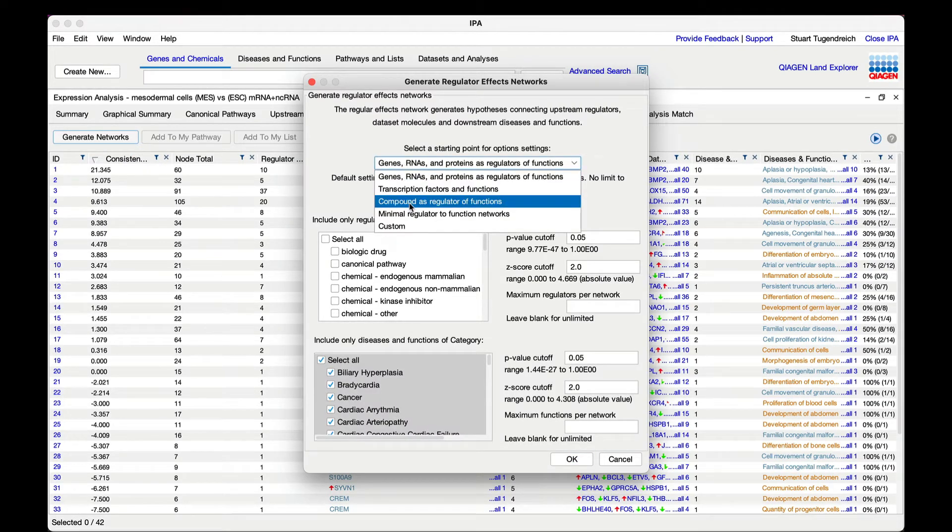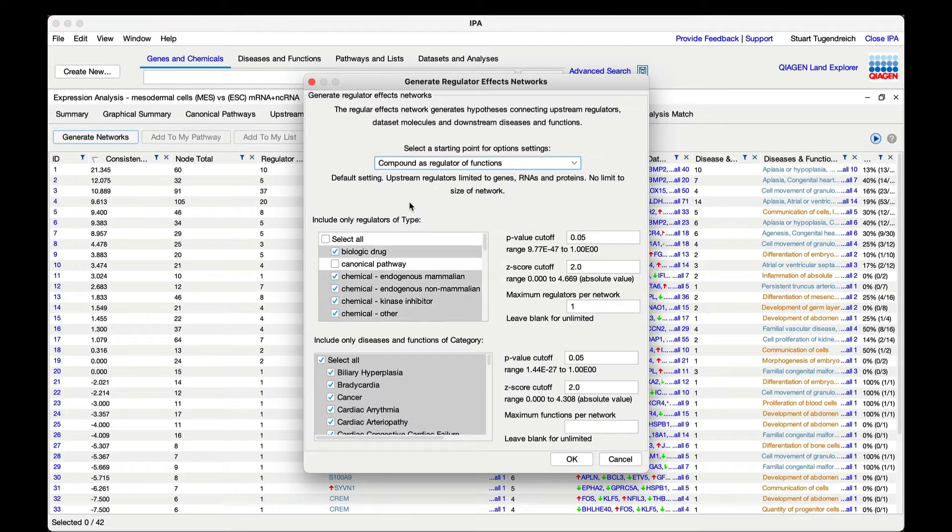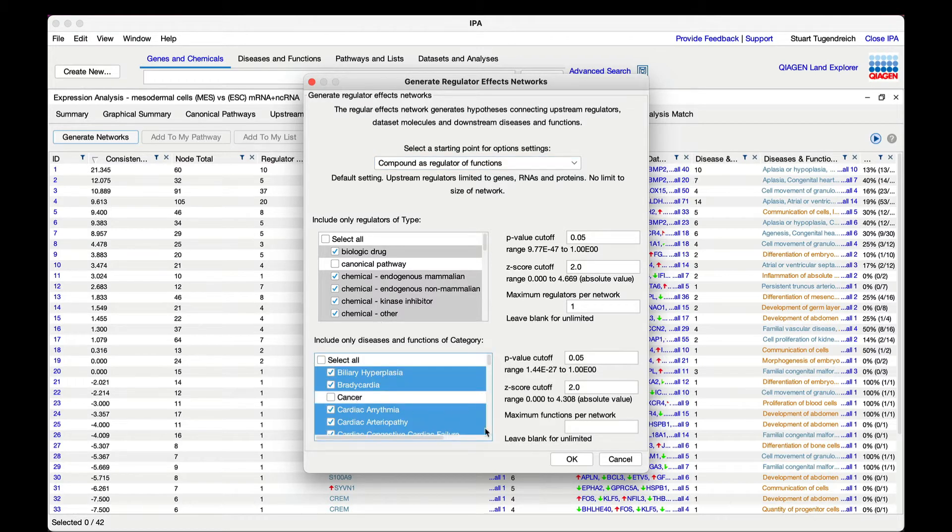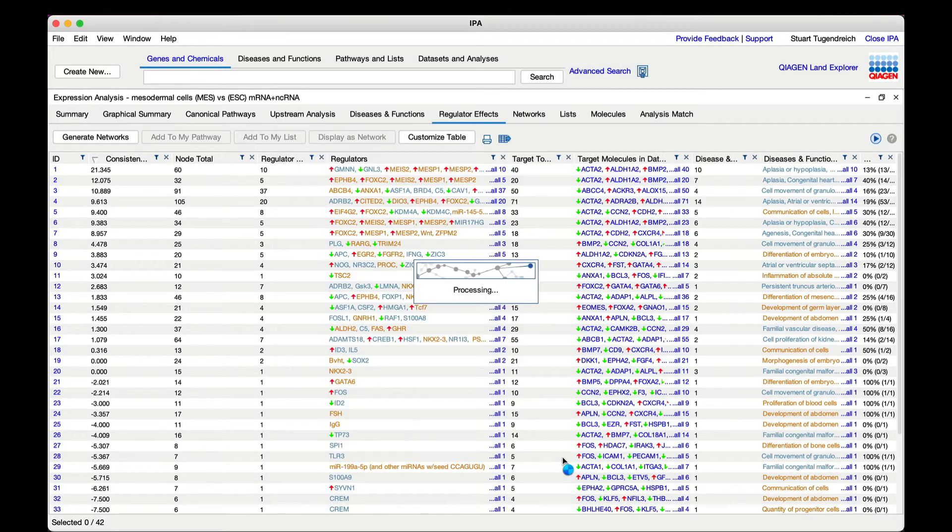If you haven't already you will have to first copy the analysis to your own project to do this. While you're here uncheck the cancer category so cancer related diseases and functions won't appear in the networks.